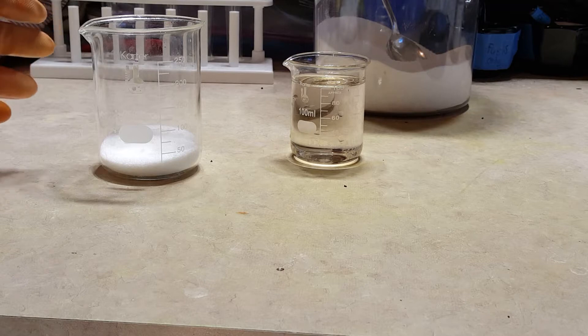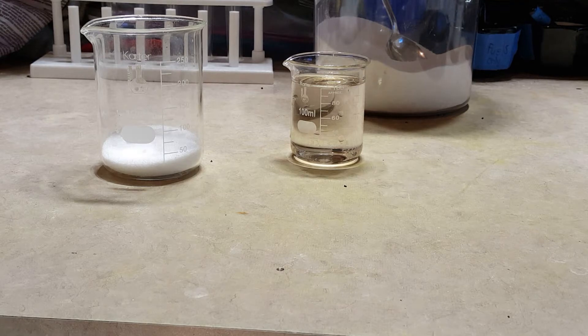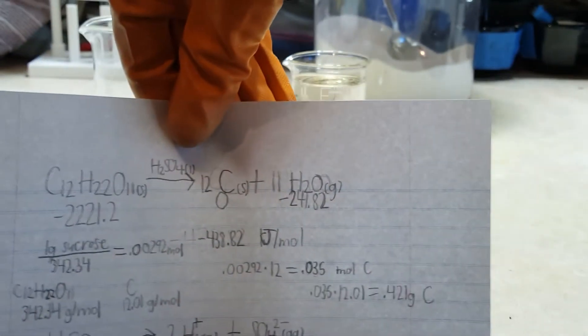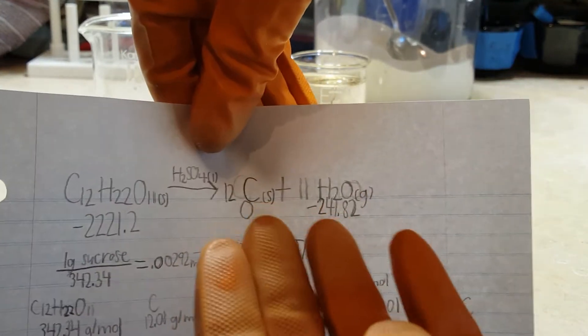Here's about 100 grams of sugar, and here's about 100 milliliters of concentrated sulfuric acid. So what happens here is sucrose, or table sugar, when mixed with concentrated sulfuric acid, loses its hydrogen and oxygen as water to the sulfuric acid, and the solid carbon is left behind.